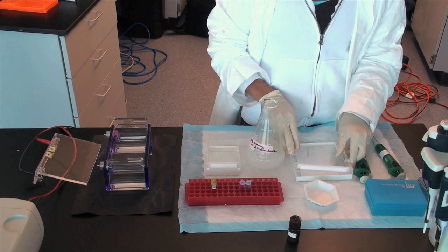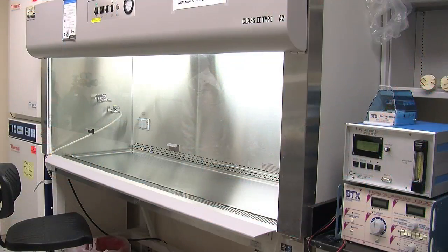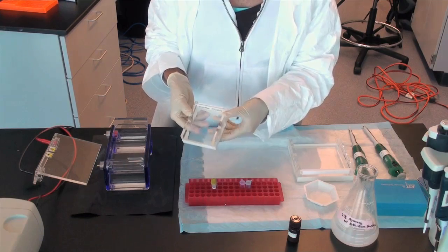Let the gel solidify in a well ventilated area. This takes 20 to 30 minutes depending on the size of the gel. I prefer to put the gel in a chemical fume hood. This way, inhaling the steam from the solution, if any, will be avoided.